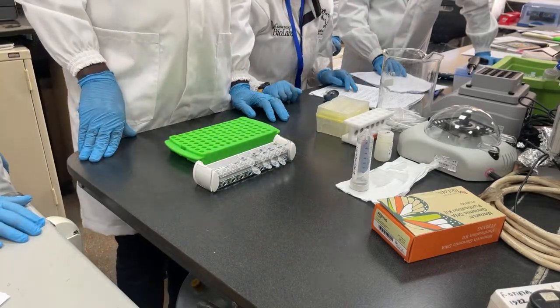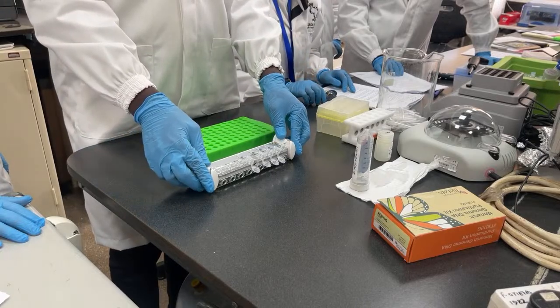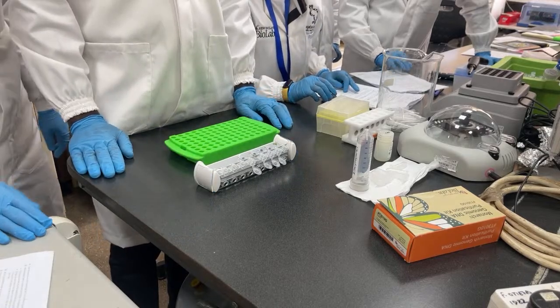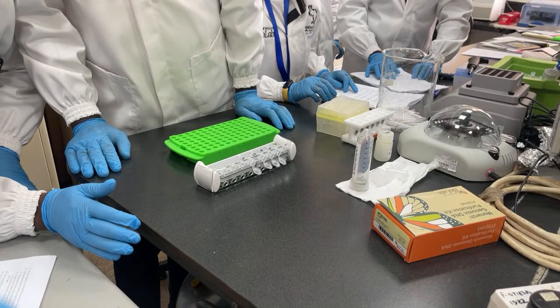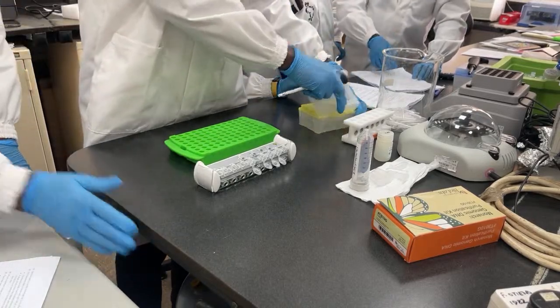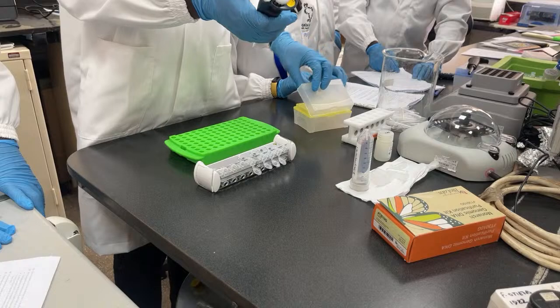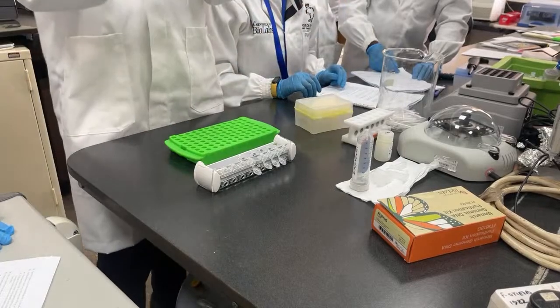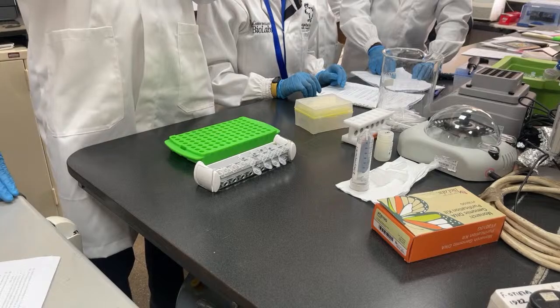Now we can turn it, put it upright, and then you remove the liquid. What's the protocol saying? At this stage you can remove the liquid from there. Some will still remain. Remove it and then go inside. Probably use a smaller tube. It doesn't matter really.